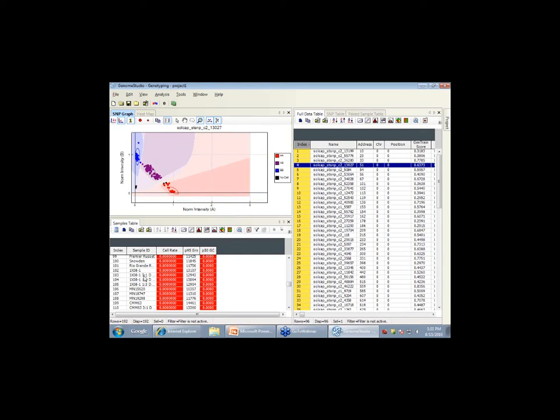And if we click these, you can see these samples, 3 to 1, 1 to 1. And you notice the dose is moving. Or actually, just highlight the samples. Number 4 SNP. Let's highlight samples 102. Scroll down to 102 to 105. And this is what we get.